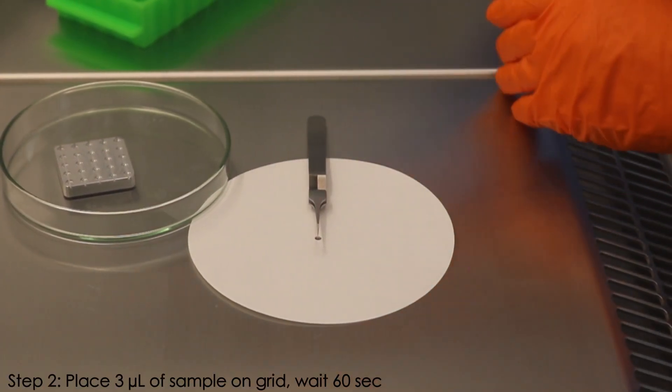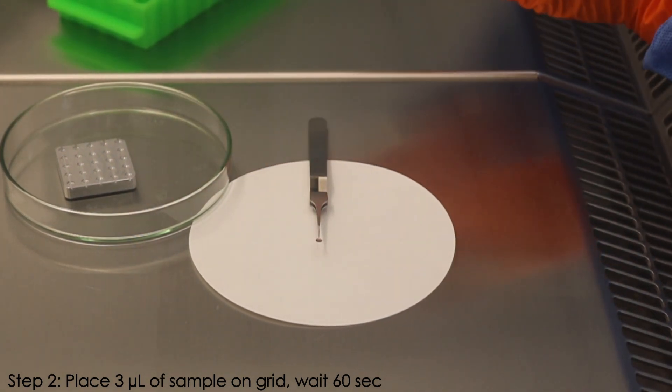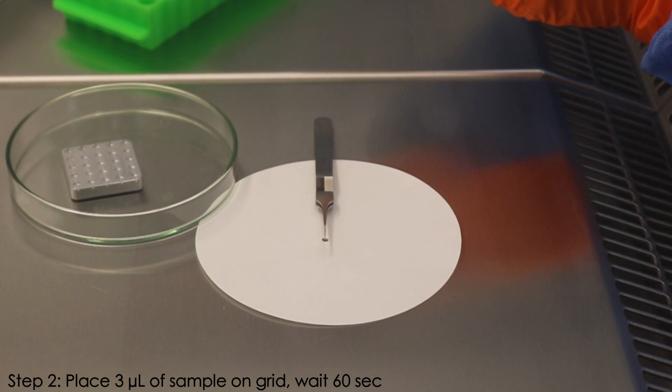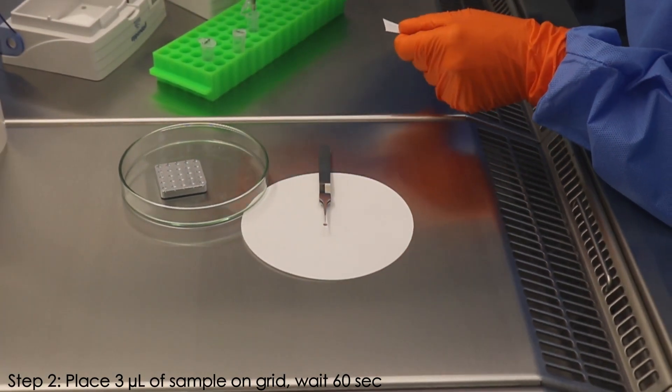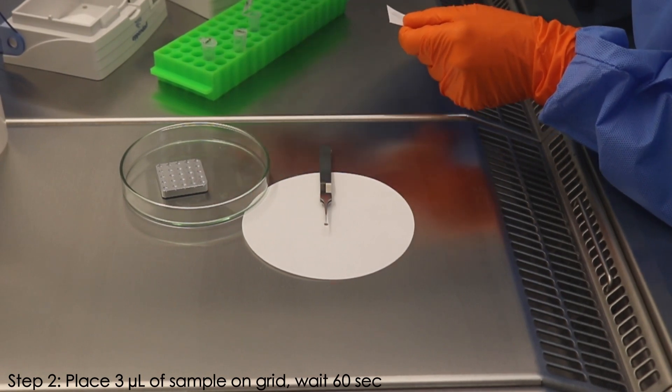Place 3 microliters of the sample on the grid. It is important during this process to keep the grid wet so that it does not dry out, so be prepared to work efficiently.